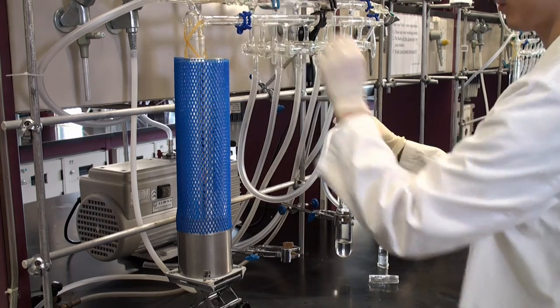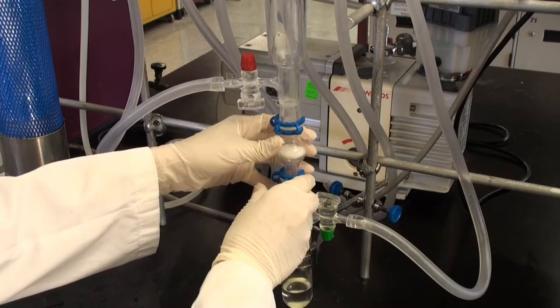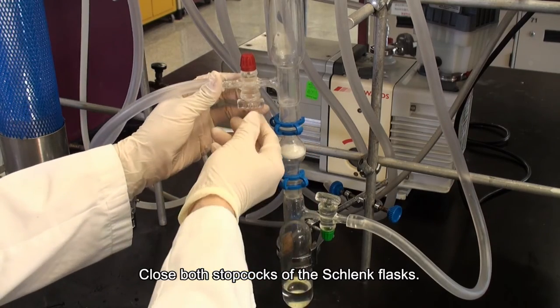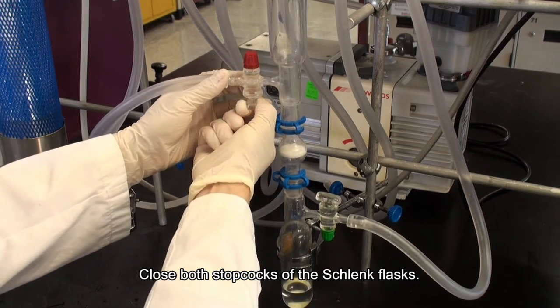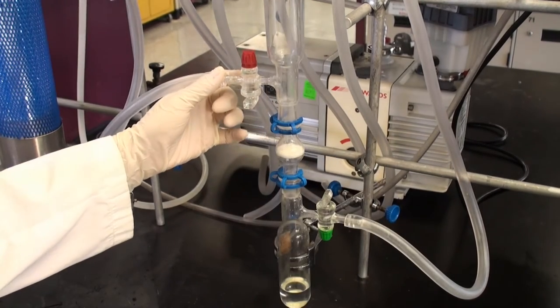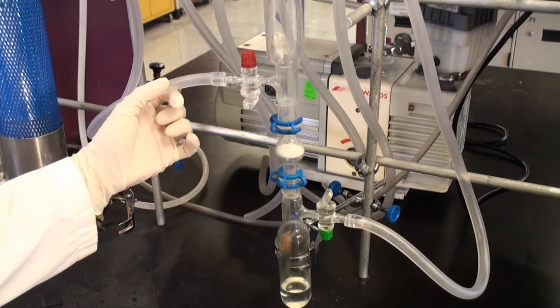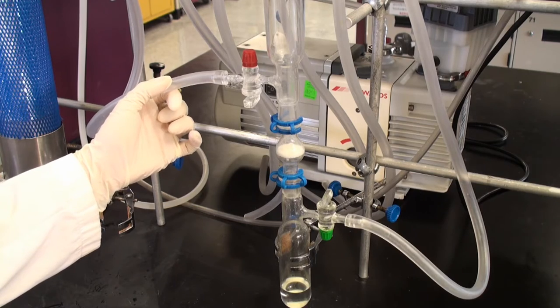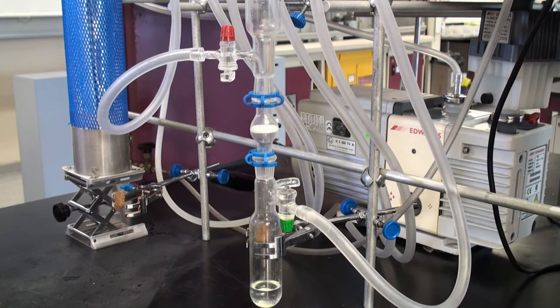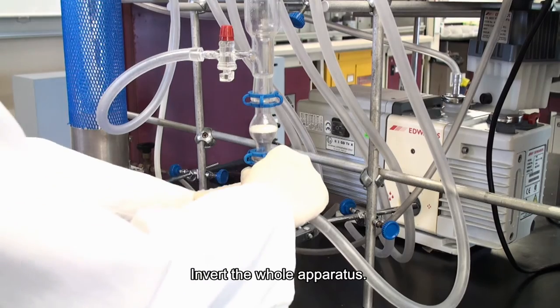Equilibrate the pressure. Close both stopcocks of the Schlenk flasks. Invert the whole apparatus.